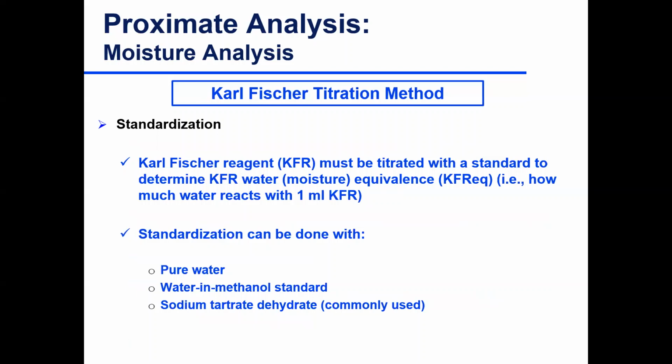It must be titrated with a standard Karl Fischer reagent. I just don't remember doing that. Maybe it comes standardized at this point, so you don't have to do it. I don't recall that, but they say you must make sure that your reagents are anhydrous in the first place. So I guess you'd have to look into that. Make sure the reagents are dry, make sure your methanol, your extracting material, is also dry. And again, you can do some standardization.